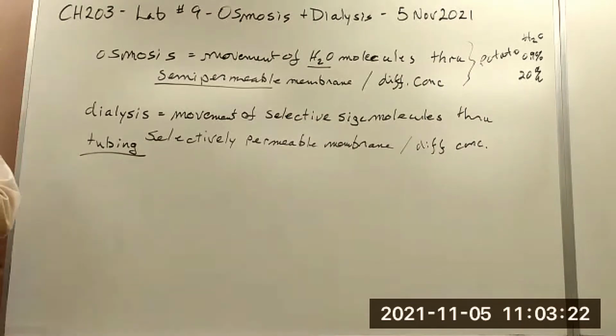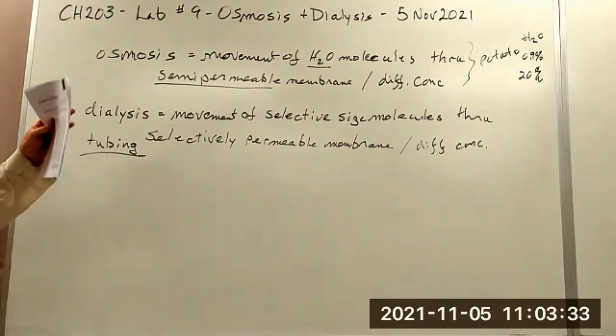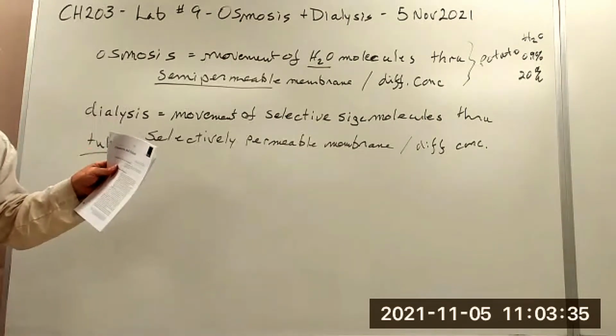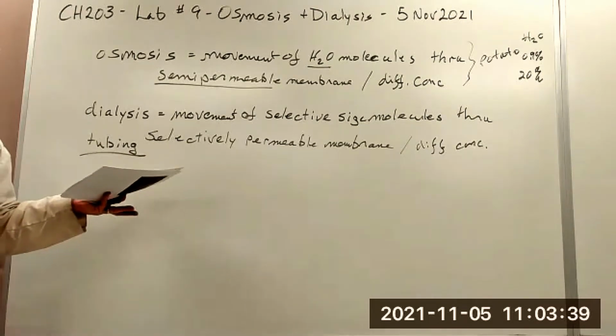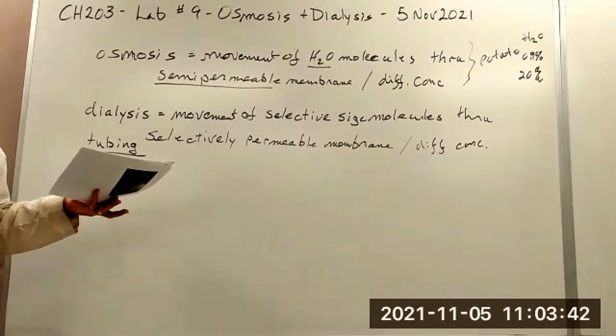Once you open up the tubing, it'll be a little bit bigger around than this marker, and about that long. Okay. So this is going to simulate kidneys or a dialysis machine.